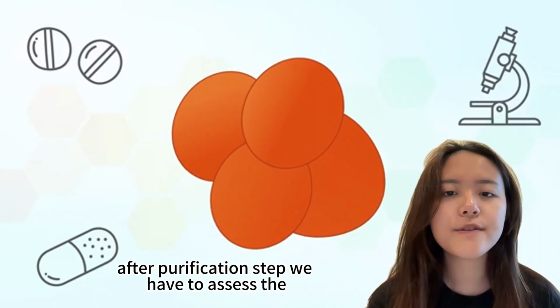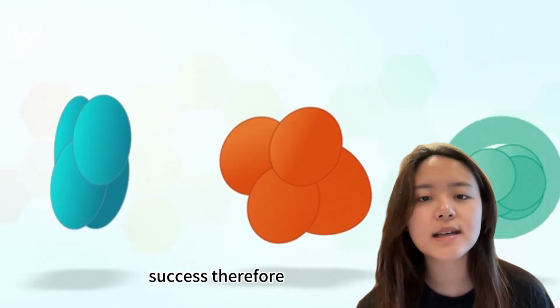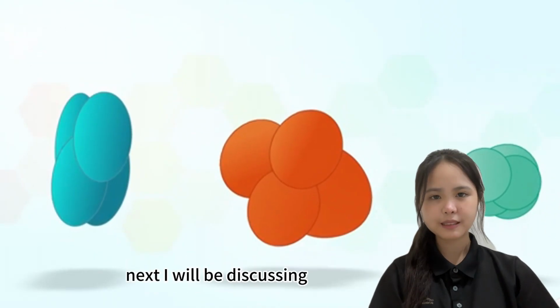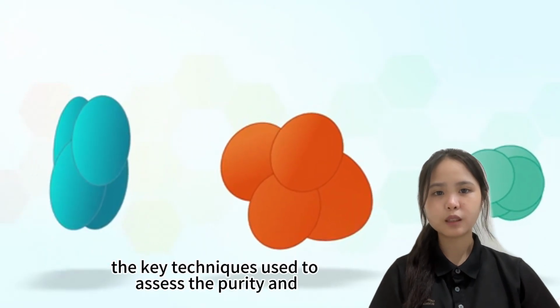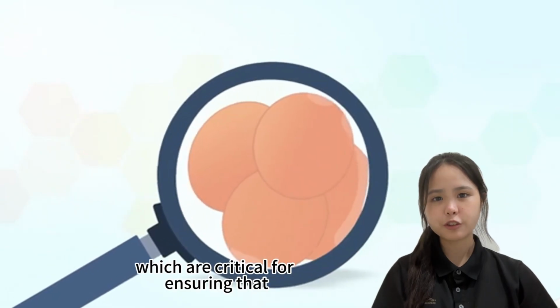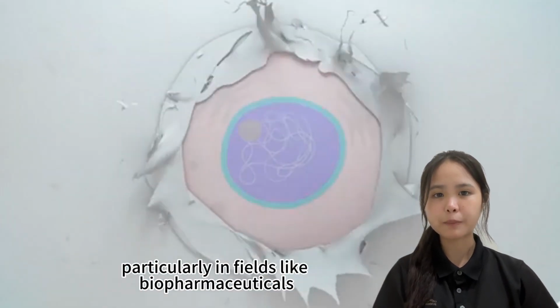After the purification step, we have to assess the purity and activity of the protein to ensure the purification succeeded. Therefore, how are the purity and activity of protein assessed? Next, I will be discussing the key techniques used to assess the purity and activities of protein during the purification process, which are critical for ensuring that our proteins are both pure and functional, particularly in fields like biopharmaceuticals.